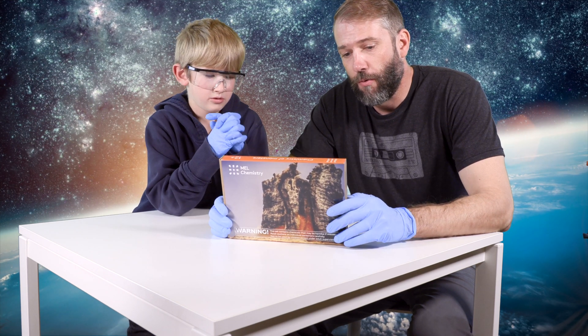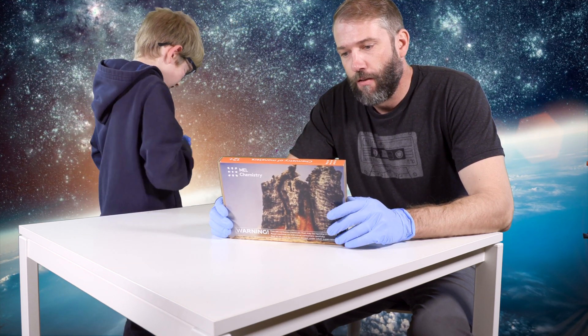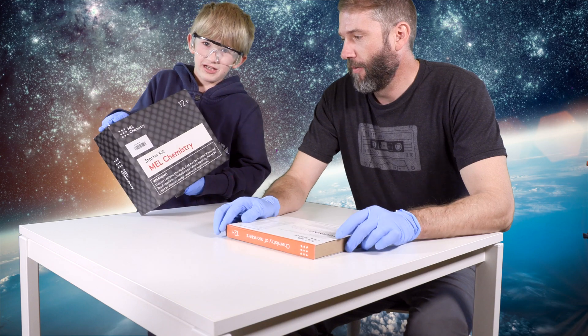In this video we're going to do the foam eruption. Foam eruption kit. We need a few things from here.